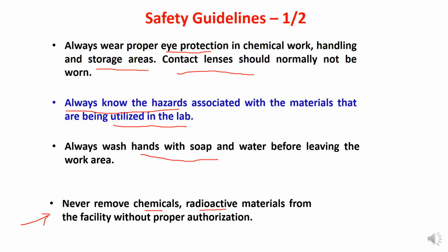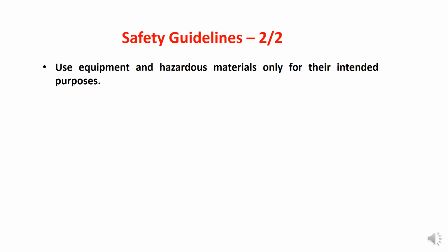If you use it, put it back in its original position, because everybody knows where those chemicals are kept in that area. If you move the position, the next person who is looking for that chemical may not find it. This is really very important with respect to storage.